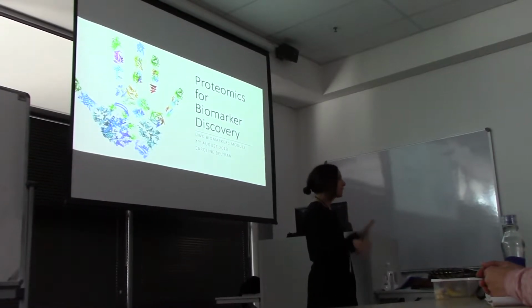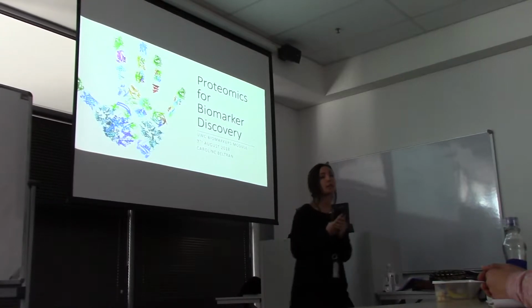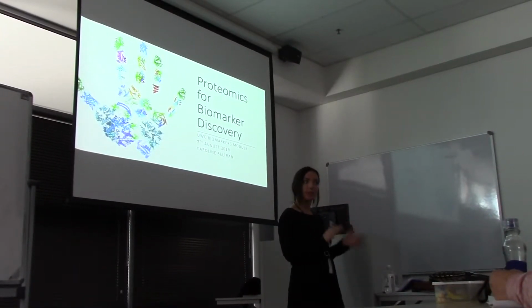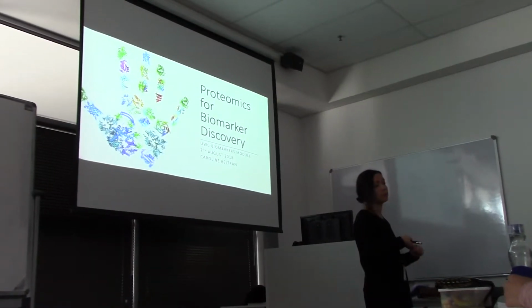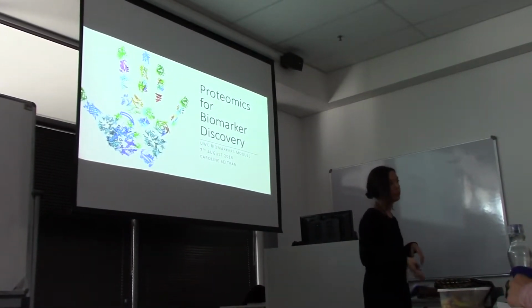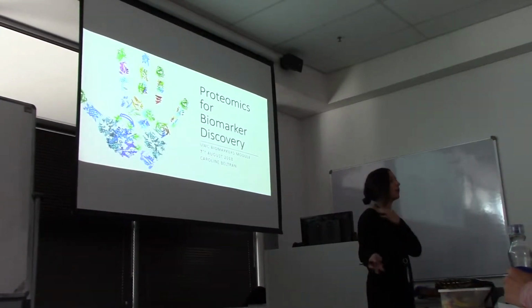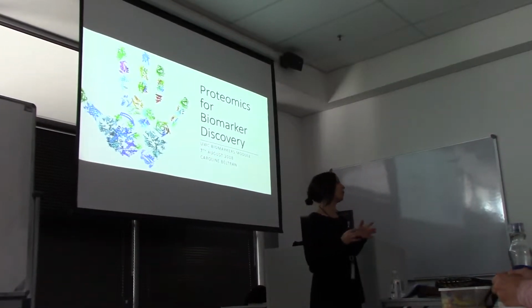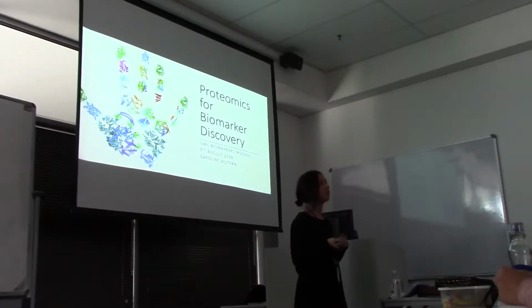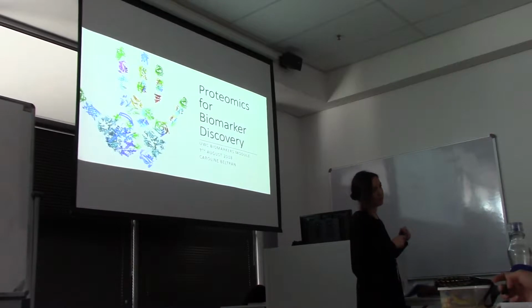I always have this disclaimer that this is not a comprehensive suite of everything, because I've tried to stick to mainly MS-based proteomics, but of course we've talked about immunoassays. I haven't gone into Western blots. I haven't gone into protein microarrays. Those do exist. We can talk about them more. If you want a lecture on it, you can always have one. But in general, proteomics is really moving towards shotgun-based, whole proteomic quantitative analysis. That's really what most of us will end up doing, and I think that's what most of the papers end up doing.